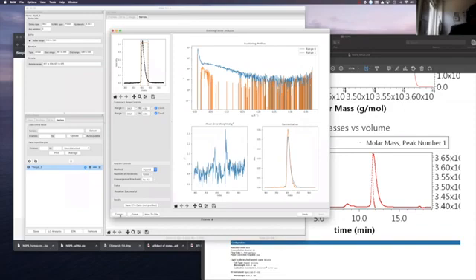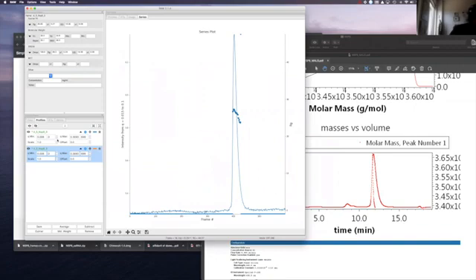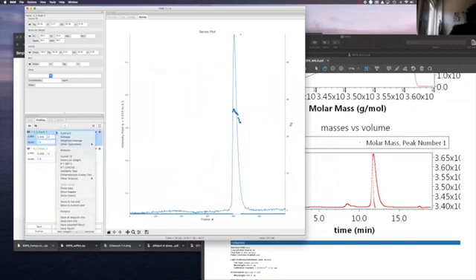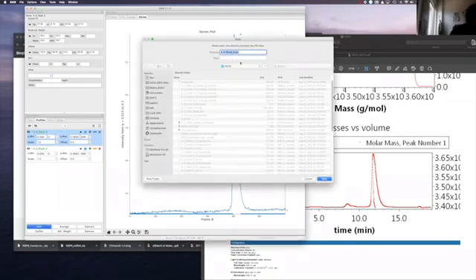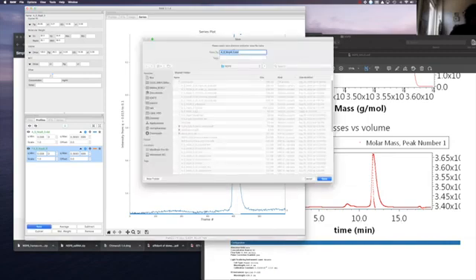So we say cancel this, and let's go to our profiles. We need to save those profiles and do some exercise with those scattering profiles. We're going to save those first. Here's the save button. Well, I can put it here, why not? Call it MSP2 data. And this one we're going to call shoulder. Okay.